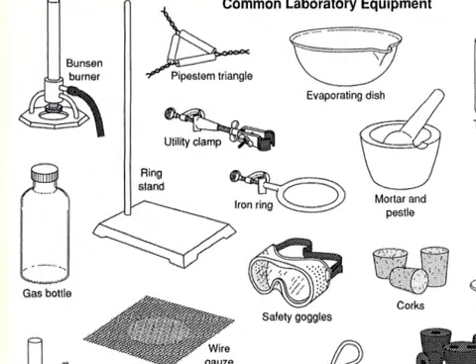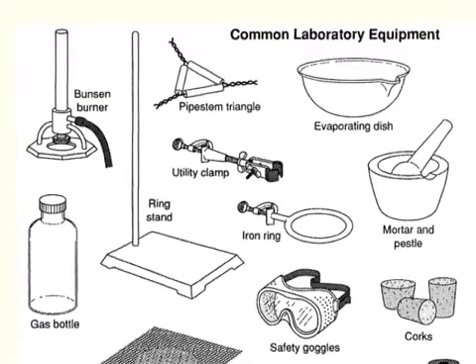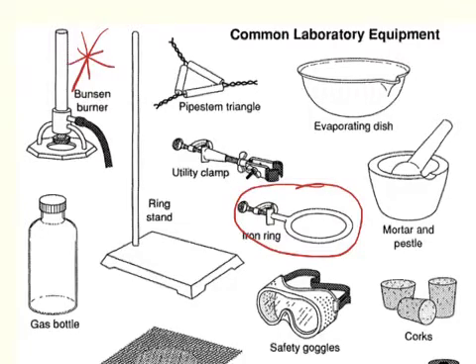Next up is the ring stand. The ring stand is used to hold things for us so we don't have to stand there and watch, and we can use them to stir. Whenever we do this, we have this nice little thing here called an iron ring. The iron ring is used to hold a beaker whenever it's over a Bunsen burner, or we also have heating pads, which we will be using most of the time because we don't have gas in our room.